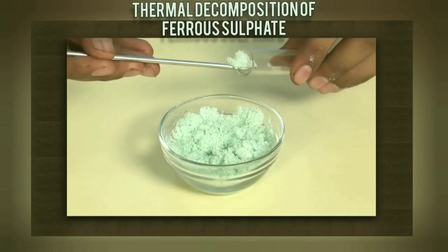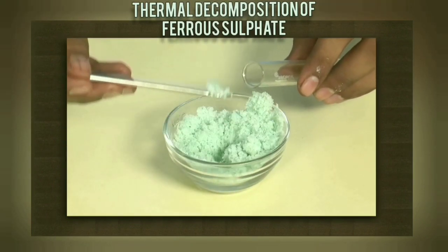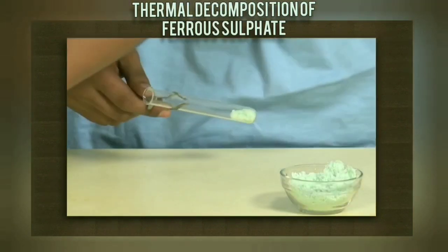Take the ferrous sulfate crystals in the test tube. Heat it over the flame.